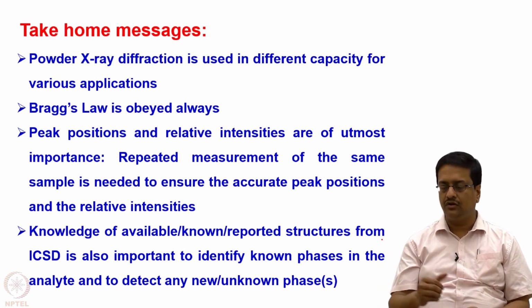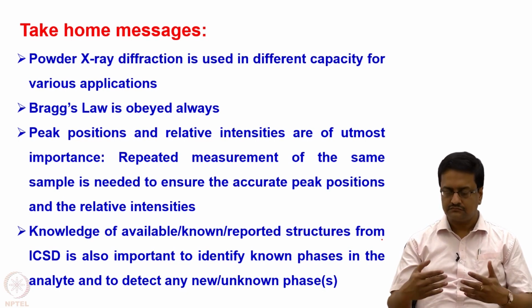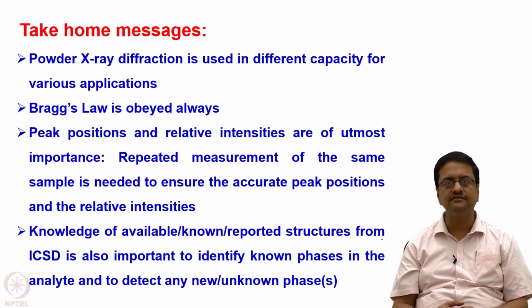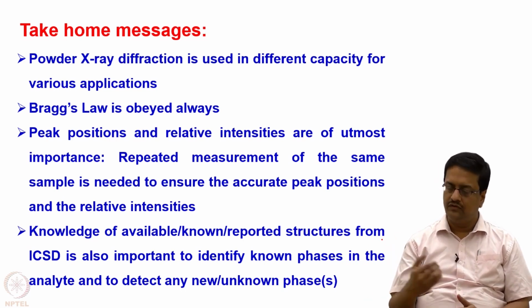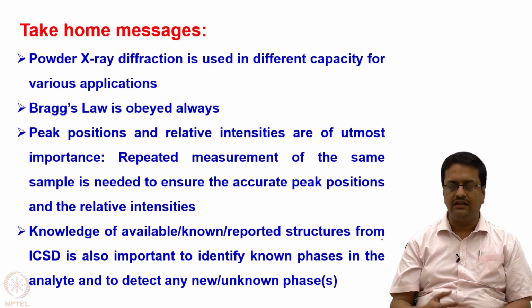Knowledge of available or known or reported structure from ICSD is also very important to identify the known phases in the analyte and to detect new or unknown phases. So when we go to the powder diffractometer room, we will demonstrate how a powder sample is prepared and data is recorded and then interpreted.